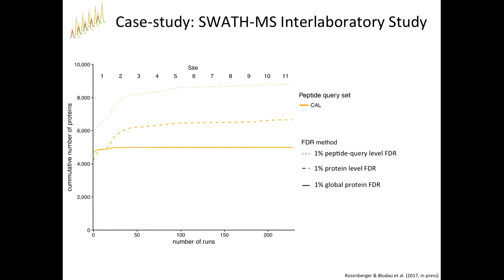I just want to add one point as you're considering that question. There's the issue of how you get these estimates, but the thing that's often not assessed is that when you have an FDR estimate, there is some variance associated with that estimate. As the size of the data set becomes smaller, the variance increases relative to the FDR.